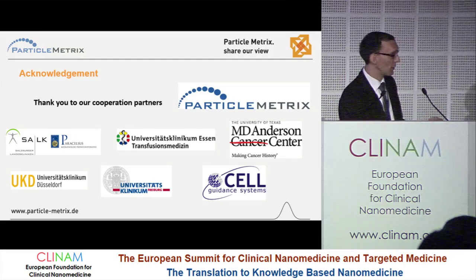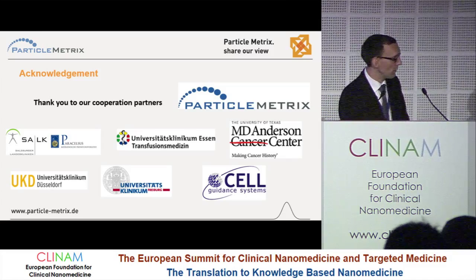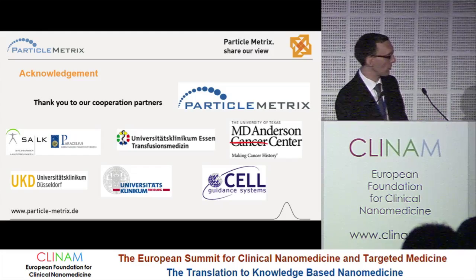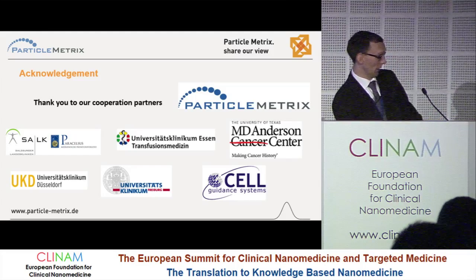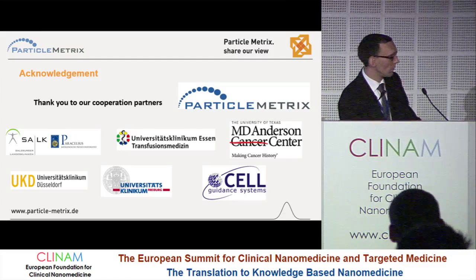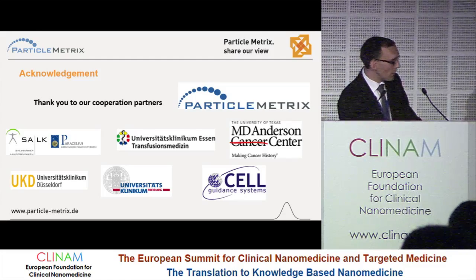But again, this is not a truly chemistry technique, and so you really need to address other instrumentation techniques in the biotech field in order to assess, for example, cell death, or whether those particles are potentially harmful or not. So it could help in certain cases because it's so sensitive? Yeah, for concentration and particle size, it's very sensitive. It goes down, as I said, to the 10 to the power 4 level, which is quite low.